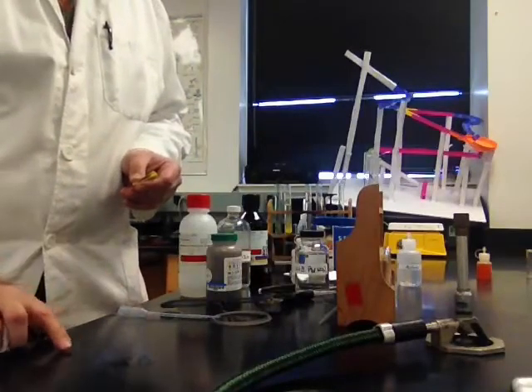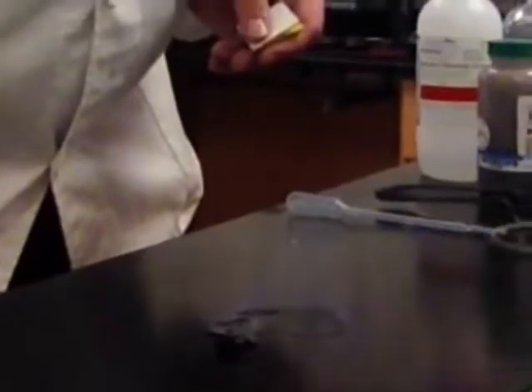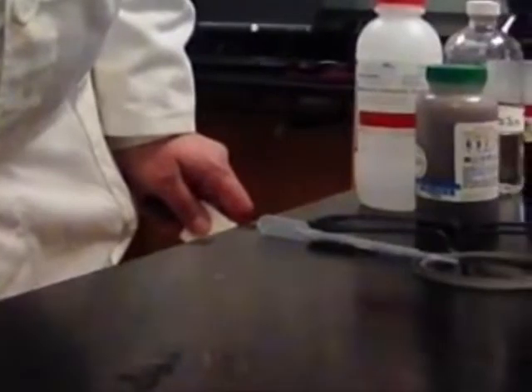Now, if you can see this, I'll see if I can move it a little bit. The fire here is blue, and there's no smoke being produced by this burning methanol. And it's almost gone. It burns very quickly. Okay? So no color really to the flame and quick burning.